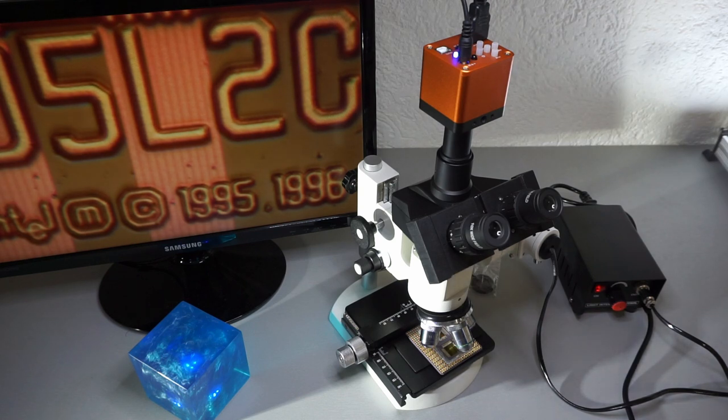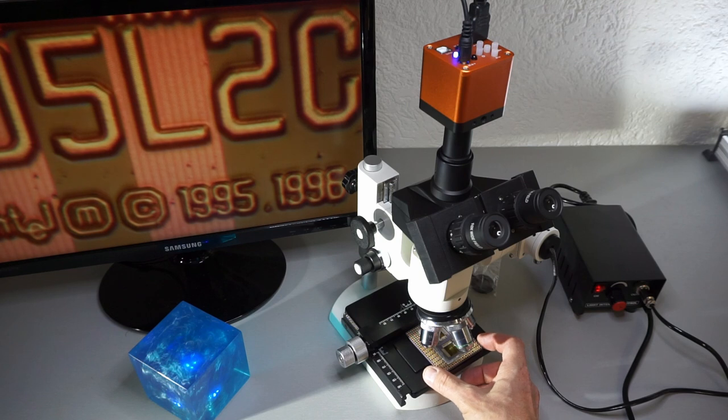And there is much more to come. There's a 10x, 40x, 60x magnification. I have to say I'm super happy. The chip here shows very nicely.